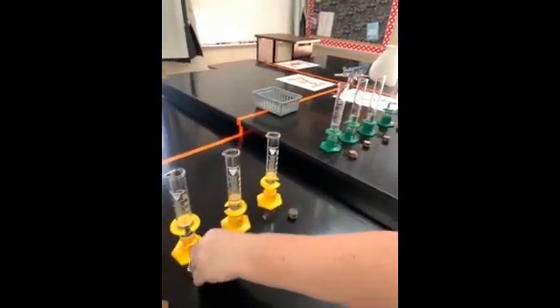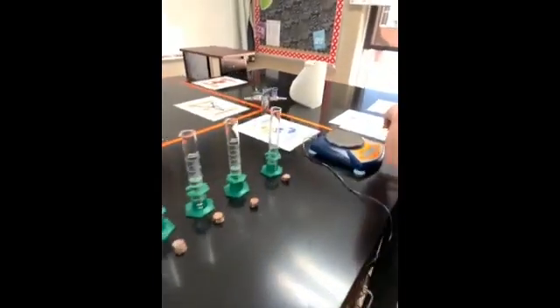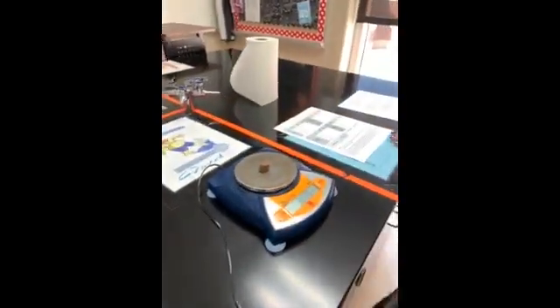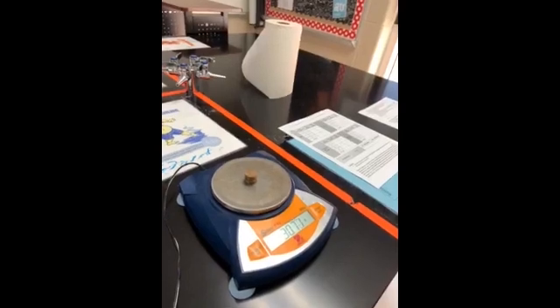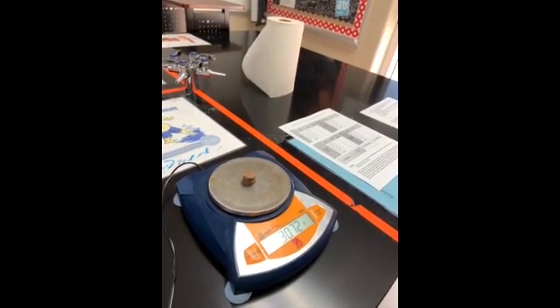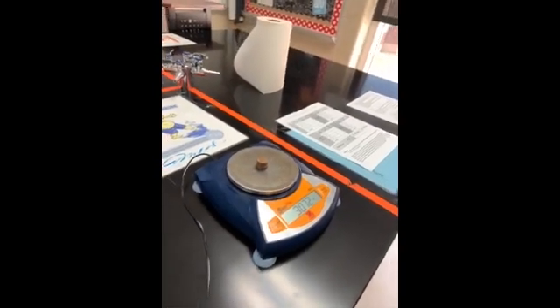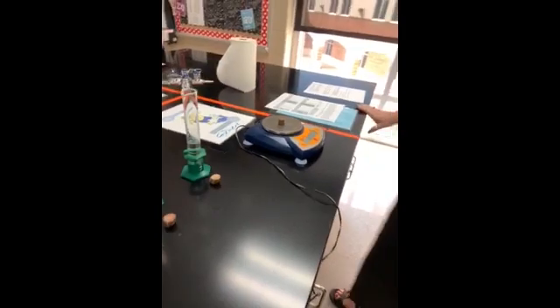Now we're going to get trial 3, pre-82 pennies. And these are in stacks of 10 pennies each as per the directions in the lab handout. All right, go ahead and write down your mass of trial 3, pre-82 pennies.